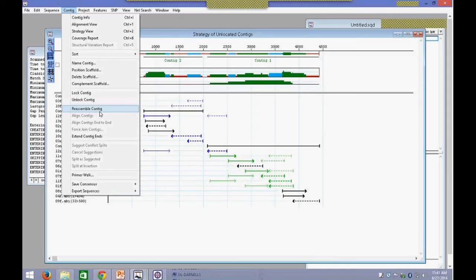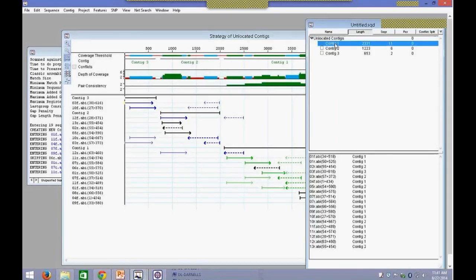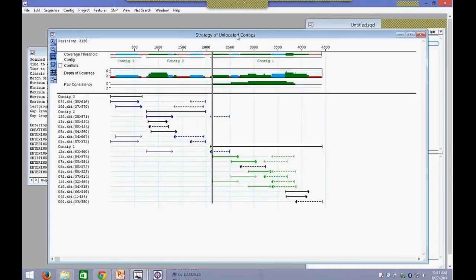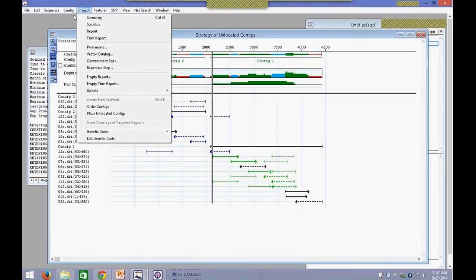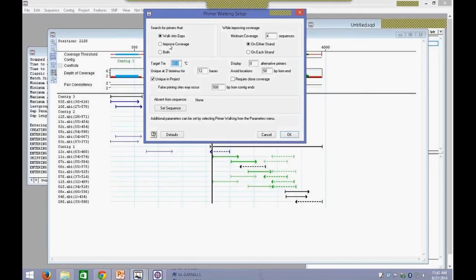There's a separate webinar by my colleague Matt Kaiser focusing on microediting within SeqMan Pro — I would recommend viewing that video if you're interested in closing gaps and performing edits. In any of the alignment views, you can delete a base, add gaps, or add bases, which will of course change your overall alignment. Also, if you wanted to improve coverage at a specific area or walk into gaps, you can design primers from within SeqMan Pro. To do that, go into the Contig menu and then Primer Walk. In Primer Walk, you can choose to walk into gaps, improve coverage, or do both. You can specify advanced parameters such as target TM, the three-prime terminus, alternate primers, and clone coverage.